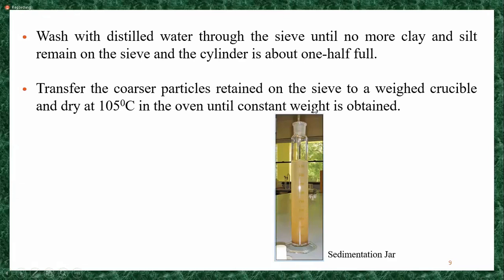I think this volume is around 1 liter. There is a cap also present in this setup. You can close the lid with this cap. So this one we can call a sedimentation jar.